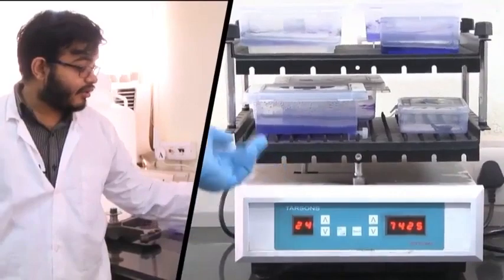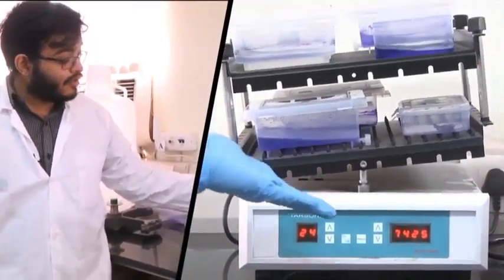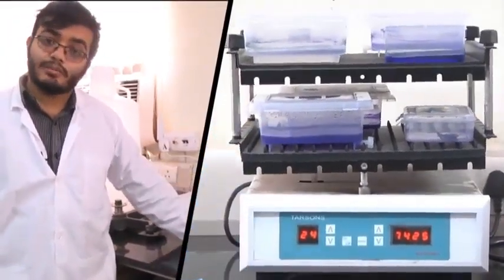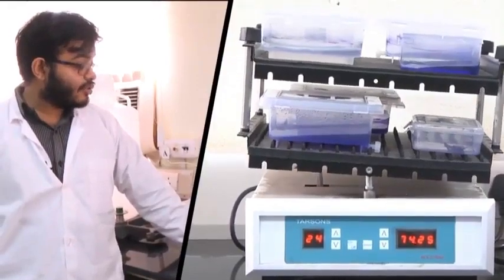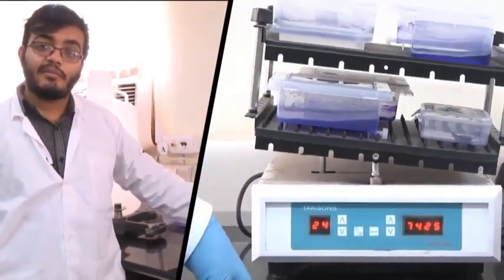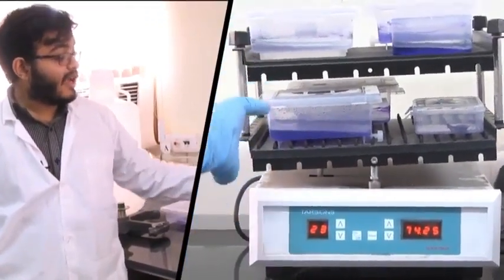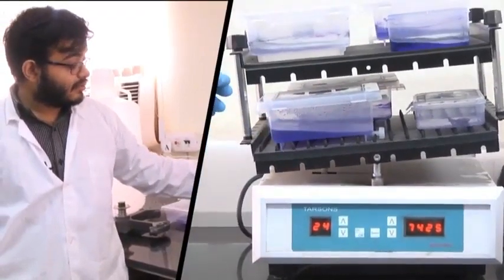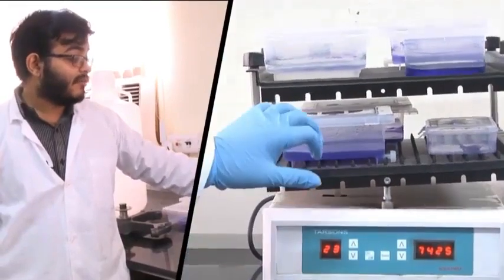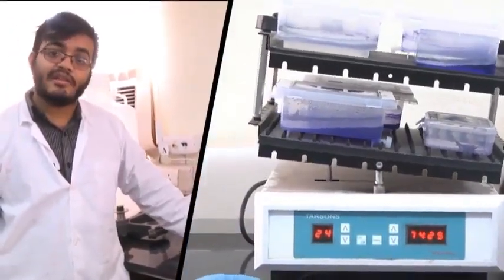So the gel is kept, and on top of that we have added the stain or the de-stain, and this uniform rocking motion ensures that the entire gel is being properly exposed to the stain solution. Apart from that, sometimes when we need to coat a surface with an antibody, what we can do is take that in a reaction tube and leave it here, and the rocking motion caused by this instrument ensures proper mixing.